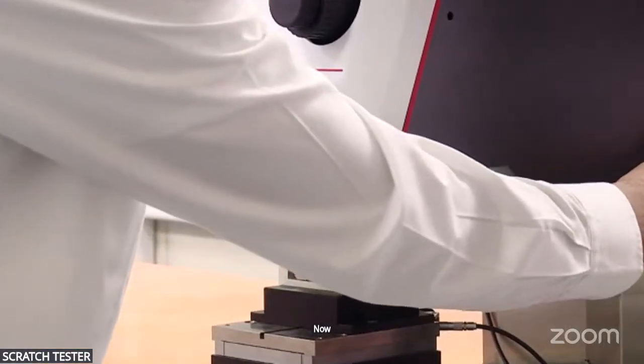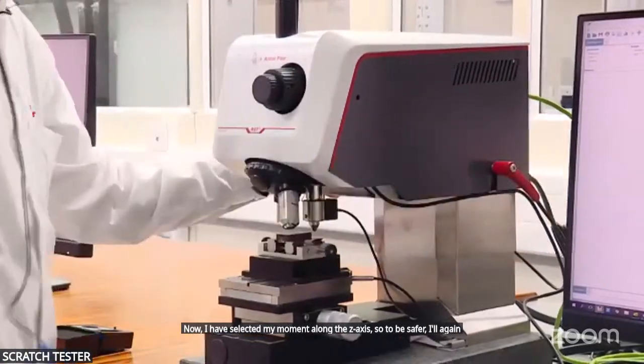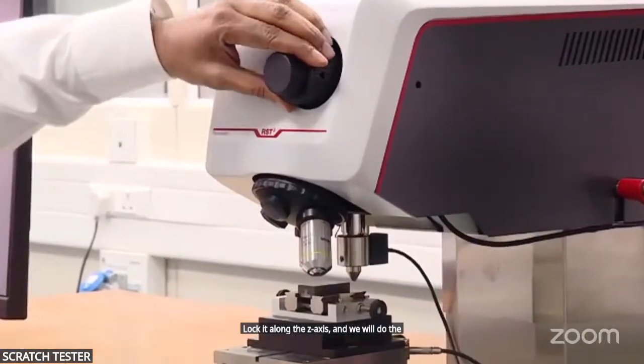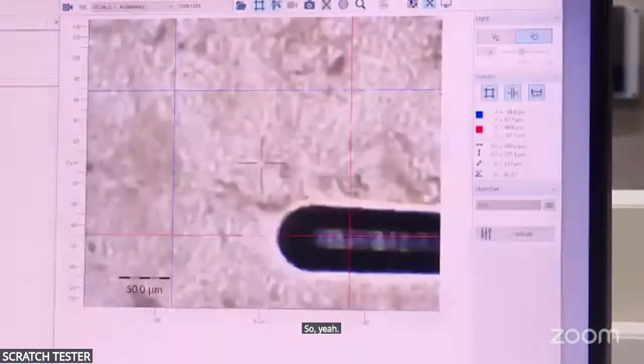Now I have selected my movement along the Z axis, so to be safer, I'll lock it again along the Z axis and we will do the focusing using the dial here. It seems we have moved a bit extra down.